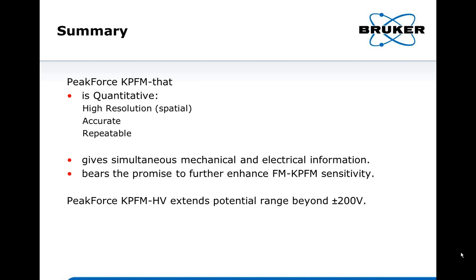Another question: the high voltage mode, isn't that one using amplitude modulation KPFM detection? Yes, in essence the resolution you get is similar to AM KPFM. That's correct.